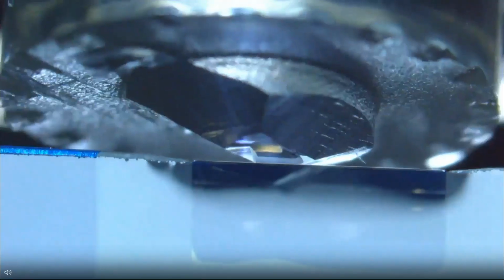This block face in the top view by the Mesa-cut mirror, in the real front view, I mean, is a little bit roundish at one edge because this is the edge of the flow-through chamber. Here you can see this is the round edge of the flow-through chamber. It's not a failure in the block face cutting.